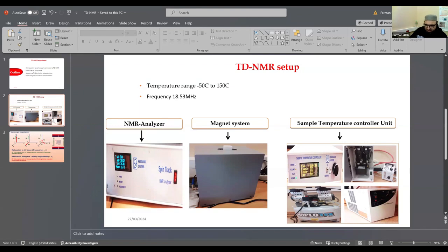First we start from room temperature. You turn on this for the air, and there is also a controller, so you have to turn them on, and this part is where you adjust what temperature you want. Here is a breaker, and there is also a button to turn on this machine. Here it's not seen clearly, but the green shows whether the cooling is on and working or not. We will use these parts to adjust the temperature of our sample.